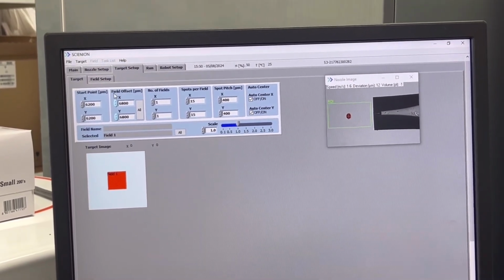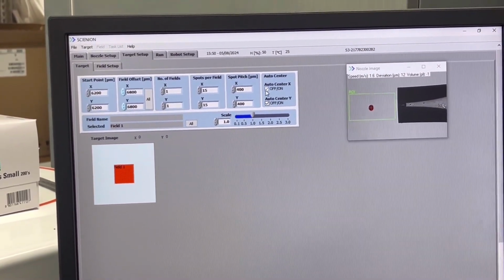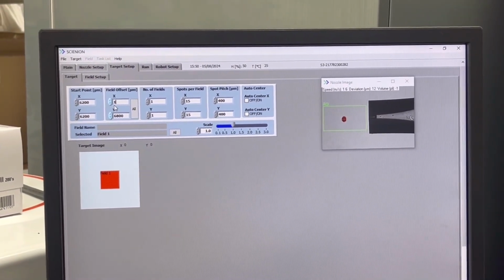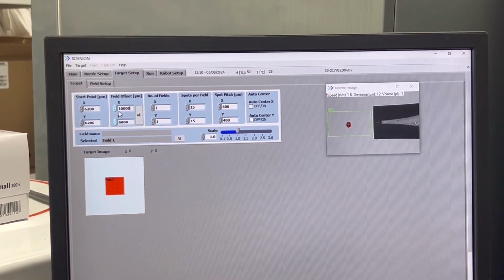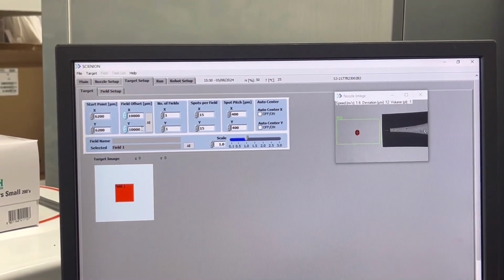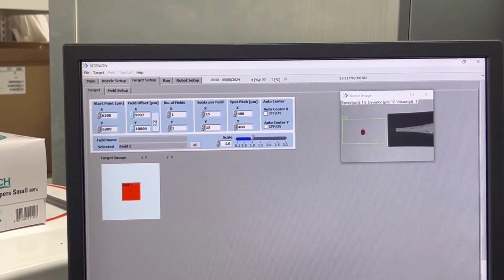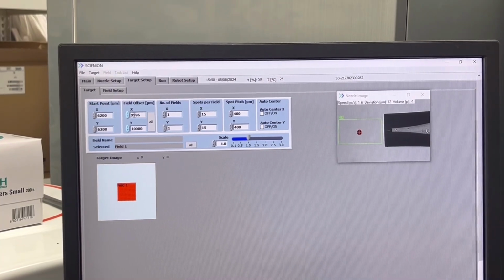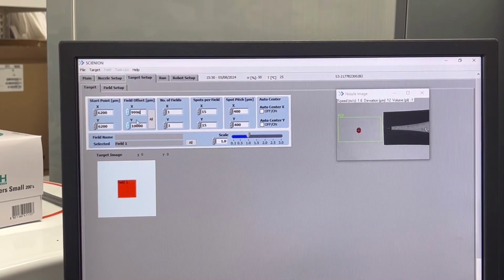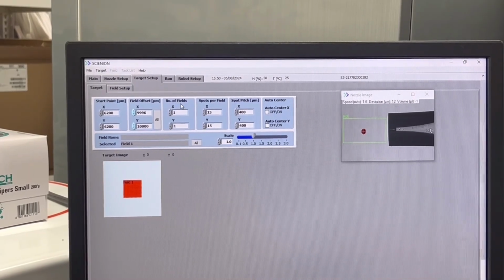And what is the field offset? Field offset means, like we can check, if we input in here 10,000, nothing changes. So field offset, this one, it's not important. I will check it later. Number of field is the number of field, easy, right?